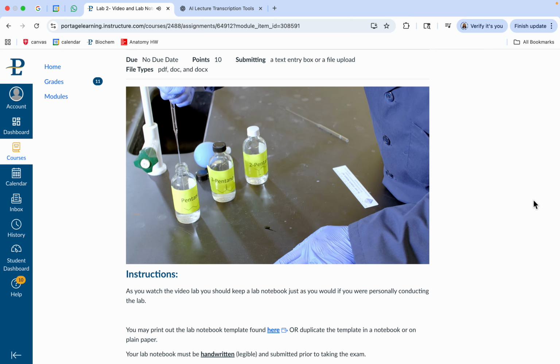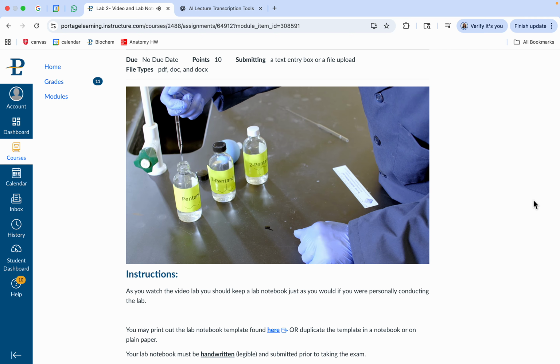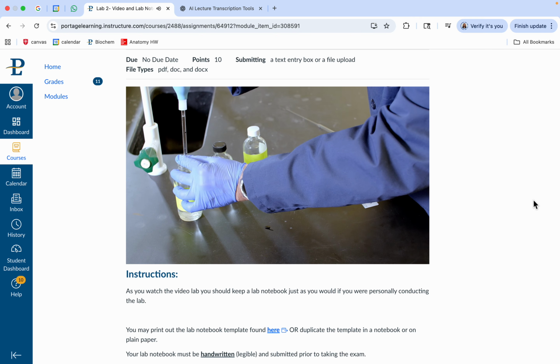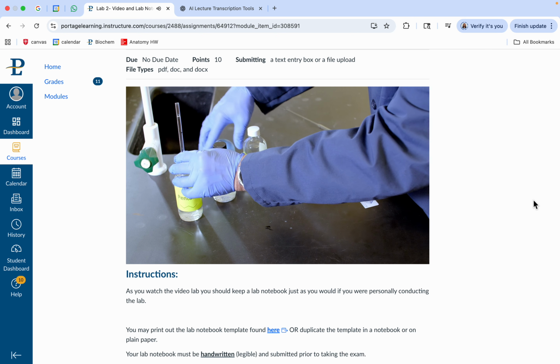And so I'm going to say start and stop for the timing. So let me get this back up. All right, so this first one, pentane. It's at the starting mark, so I'm going to say start, stop. All right, that was our first one. We're going to repeat it 3 times to make sure that we're getting accurate measurements. And once again, we're at our top mark, so I'm going to say start and stop. It's down to that second mark.